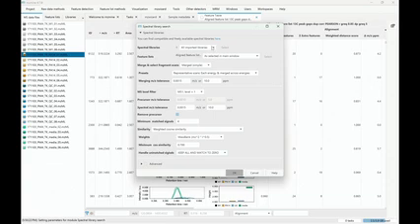Yeah, actually, we're still working on it. With this, you're going to see that spectral library matching has a lot of options because we want to give you a lot of options. There's also a lot of options for merging the spectra, because let's say you acquire spectra with CID, HCD, UVPD, multiple methods. We actually do the merging on the separate methods. We're going to merge on different energies, across energies, and you can select all of this here to have the most control. You can also just say, I want to have the representative scans, and then mzmine is going to figure out what is representative for your data set.